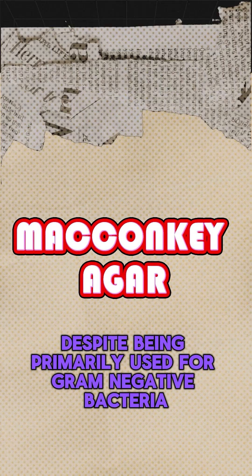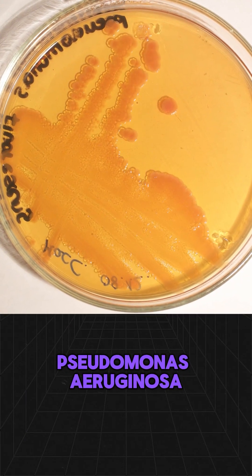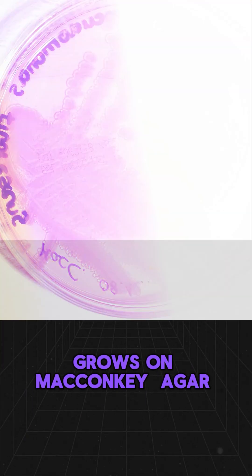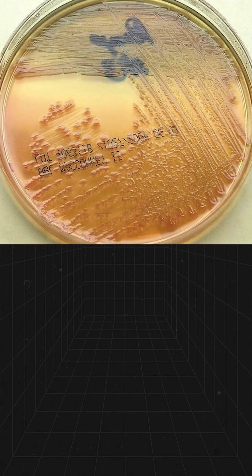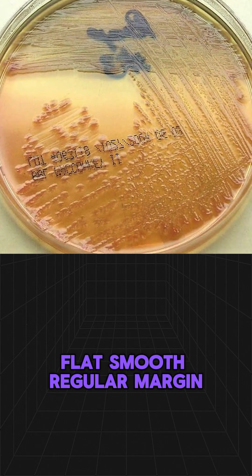Despite being primarily used for gram-negative bacteria, Pseudomonas aeruginosa grows on MacConkey agar without fermenting lactose, leading to colourless colonies — flat, smooth, with a regular margin.